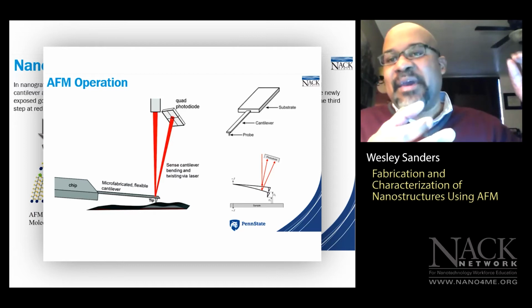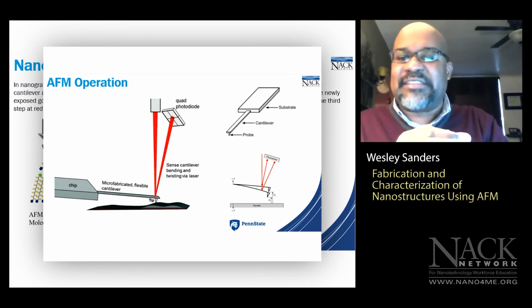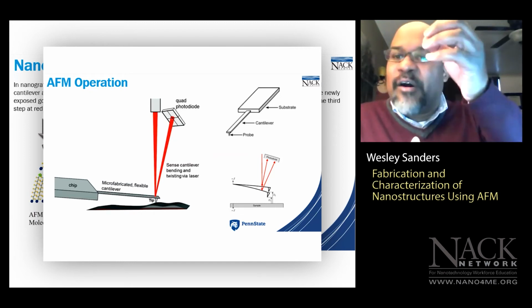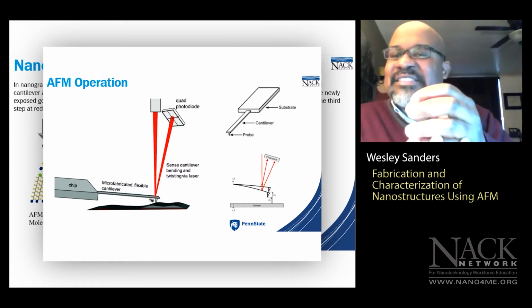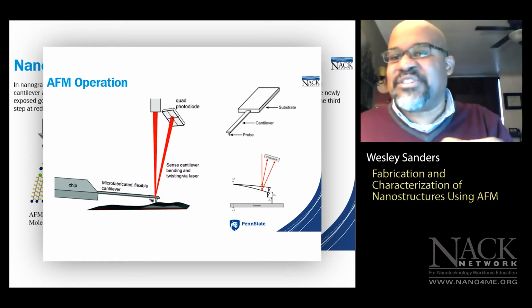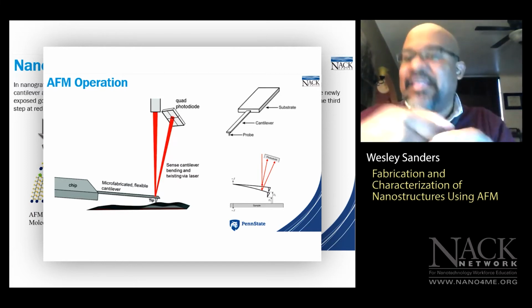And that's actually the best configuration, because if you have a sample scanning system where you have the piezo materials underneath the specimen or sample, then you run the risk of damaging the piezo ceramics when you take your sample on and off the stage.